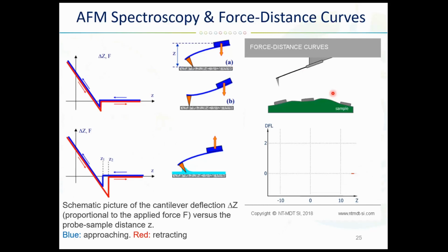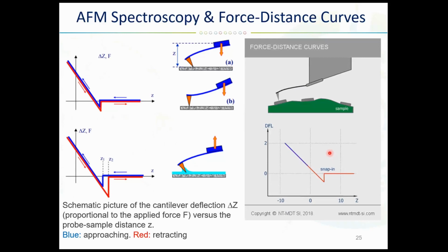Okay, and then just as a reminder, once again, Hooke's law gives us the possibility to look into different molecular properties. These are how force distance curves work. What we're interested in, you should be familiar with the actual image here, is the difference between these 2 angles.